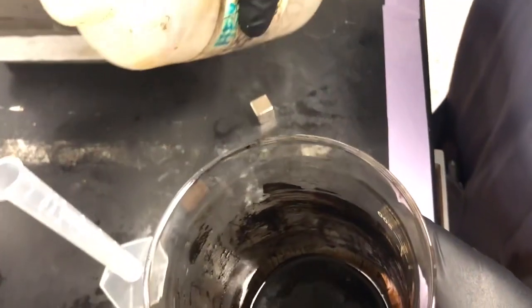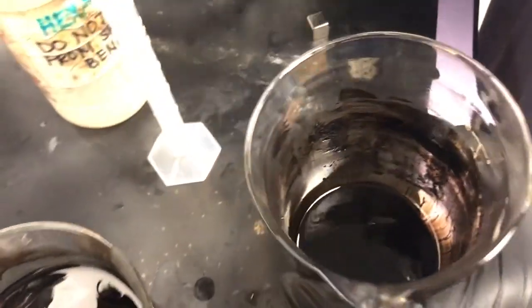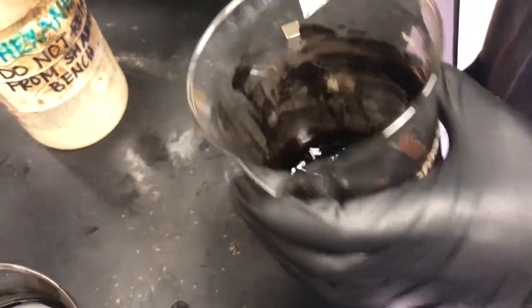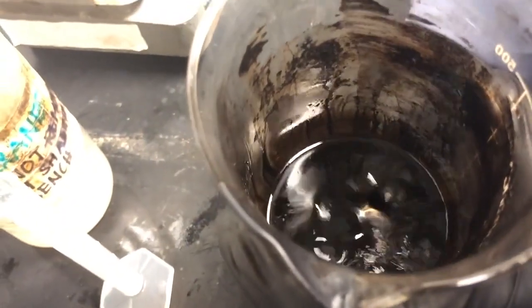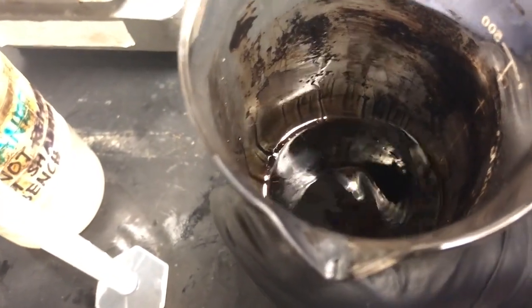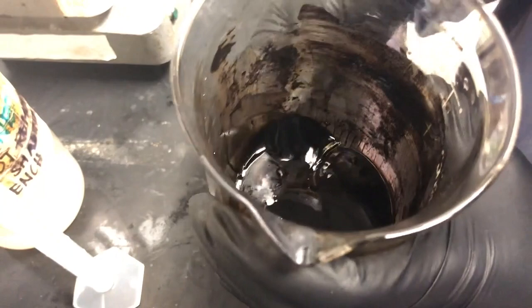So now let's add about 5 mils or 3 mils or so of hexane, and we'll show what happens when you use simply too much hexane. The spiking behavior effectively goes away. And so you can see there, it's trying to spike, but it's just too much liquid. You can see tiny amounts, but the liquid's covering up all those beautiful spikes.